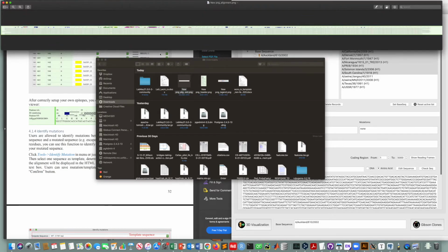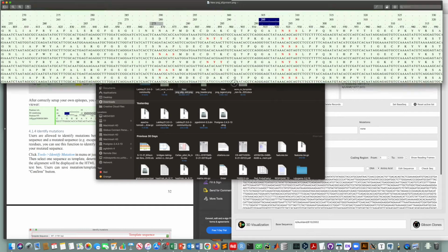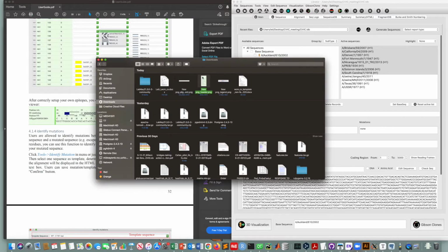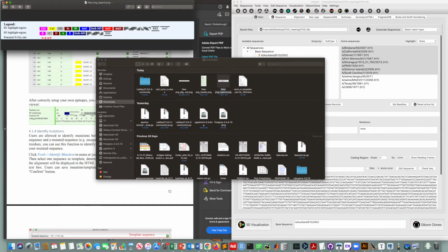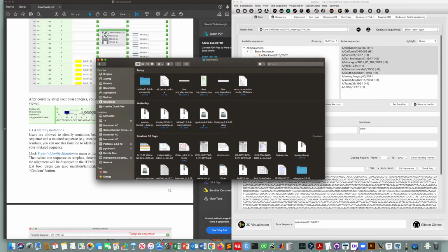The first one is the sequence. You can zoom in. It's pretty big. You can zoom in to see all the details. The second part, on the left, is the sequence names, and the third part is the legend. So you can use these figures in your slides.